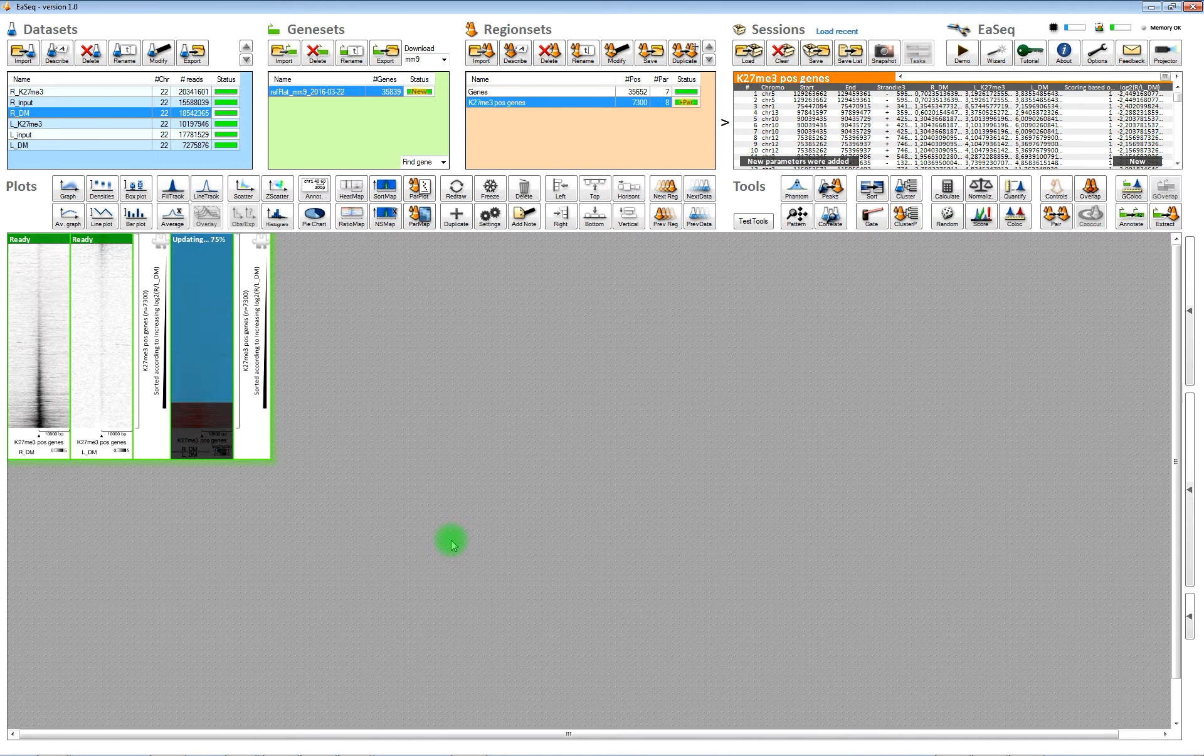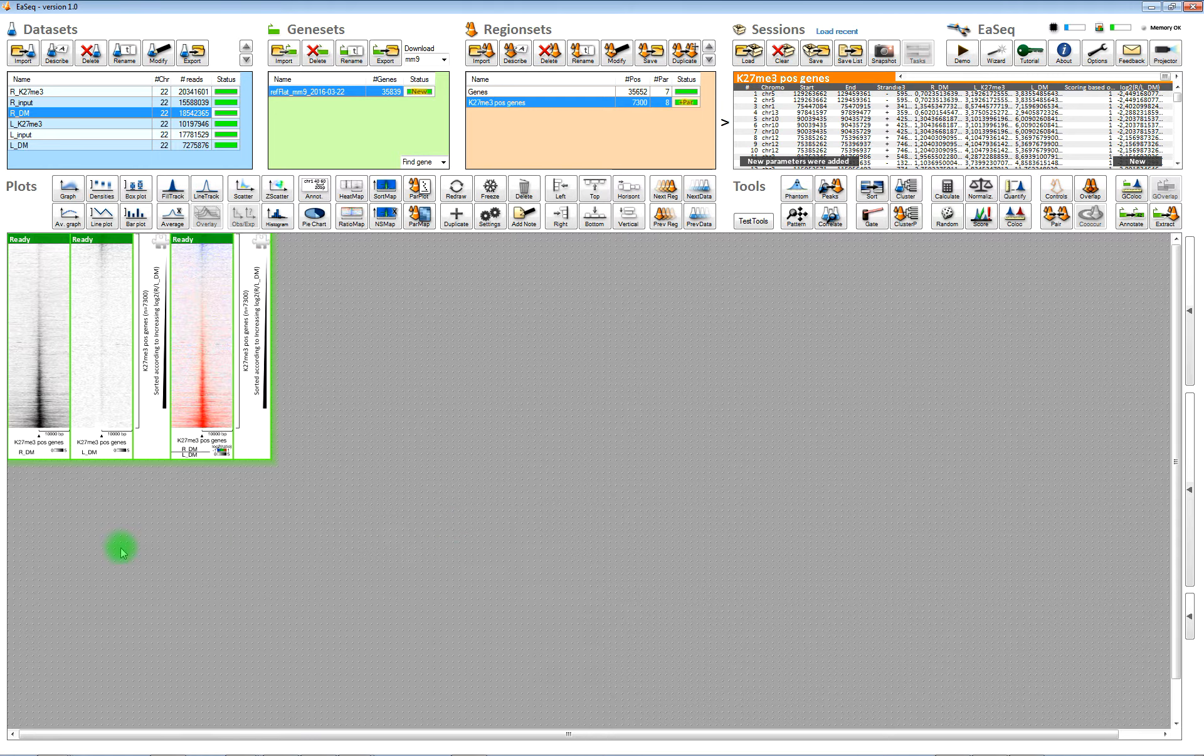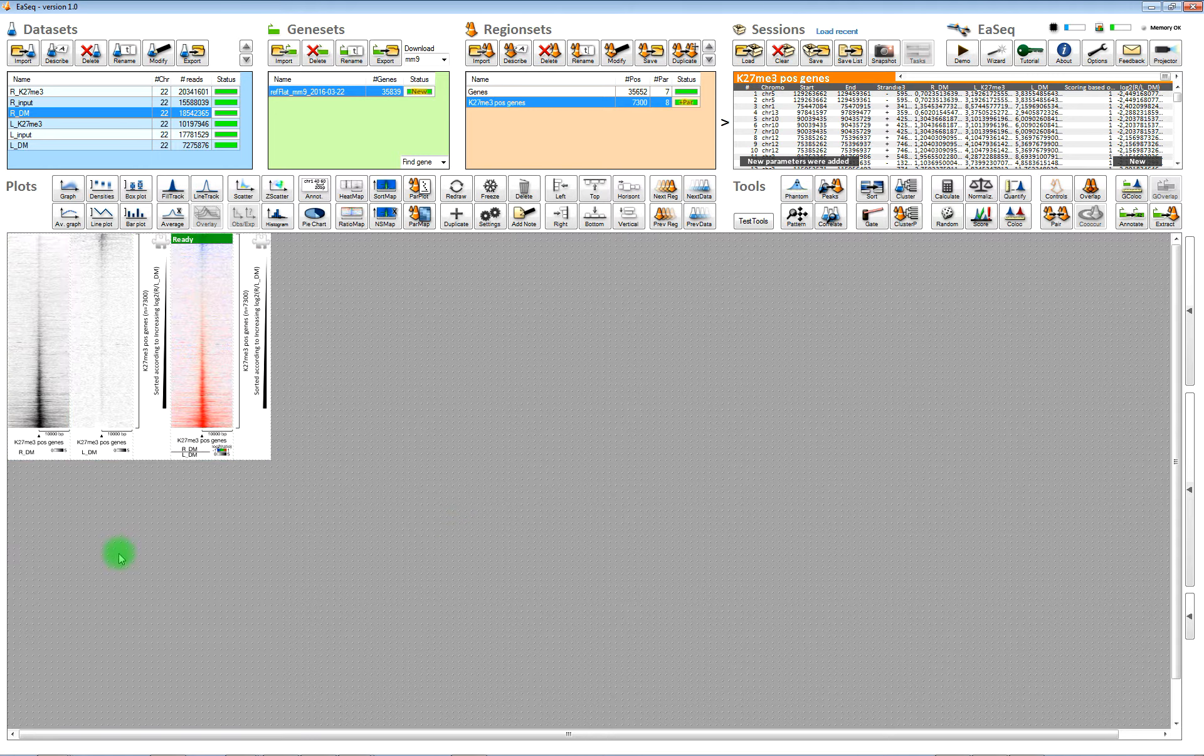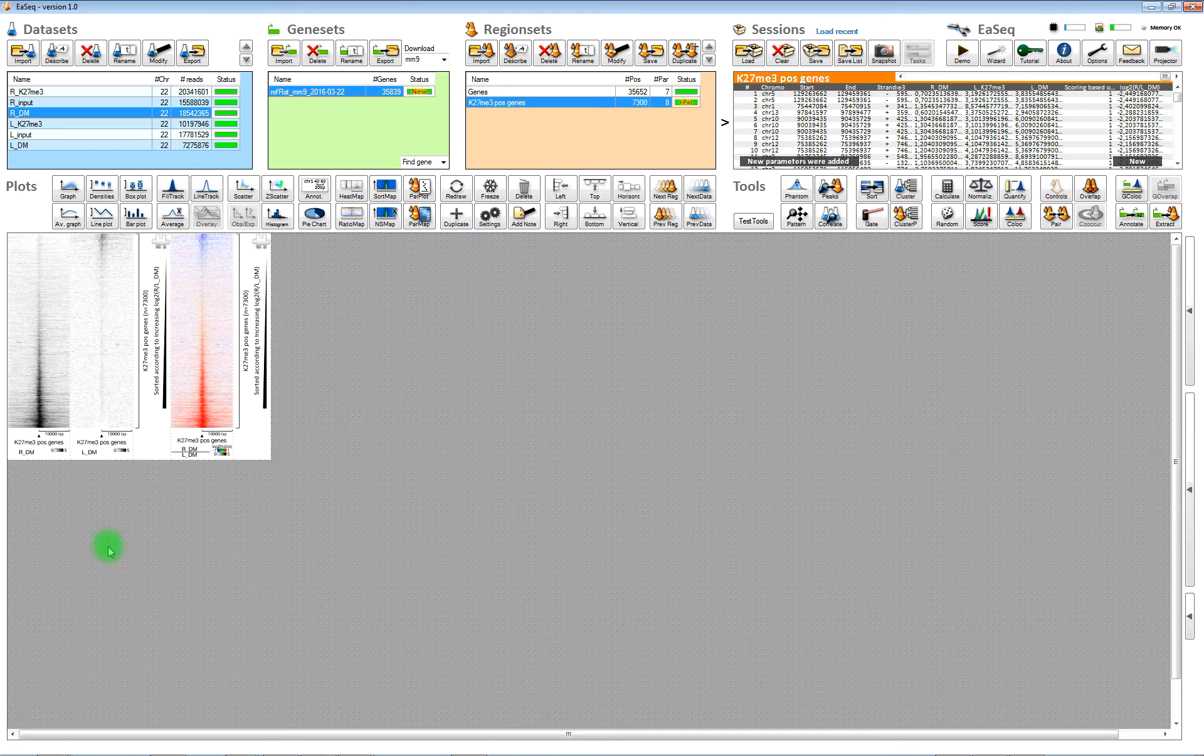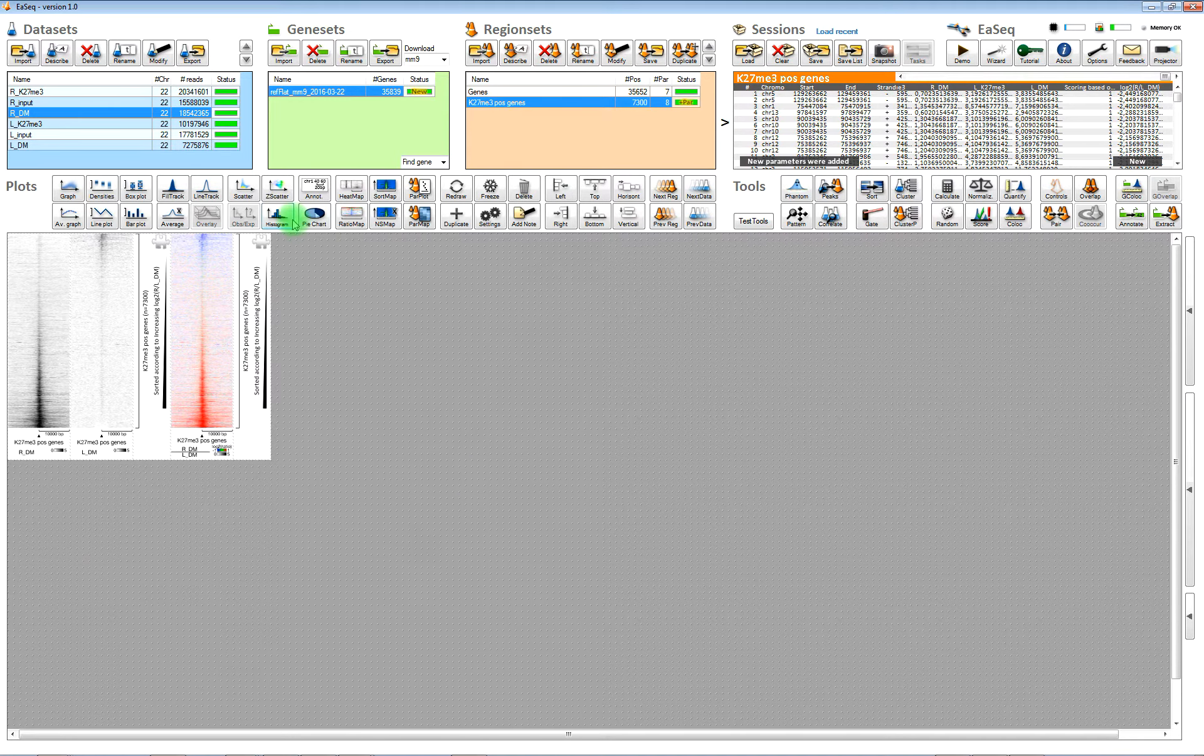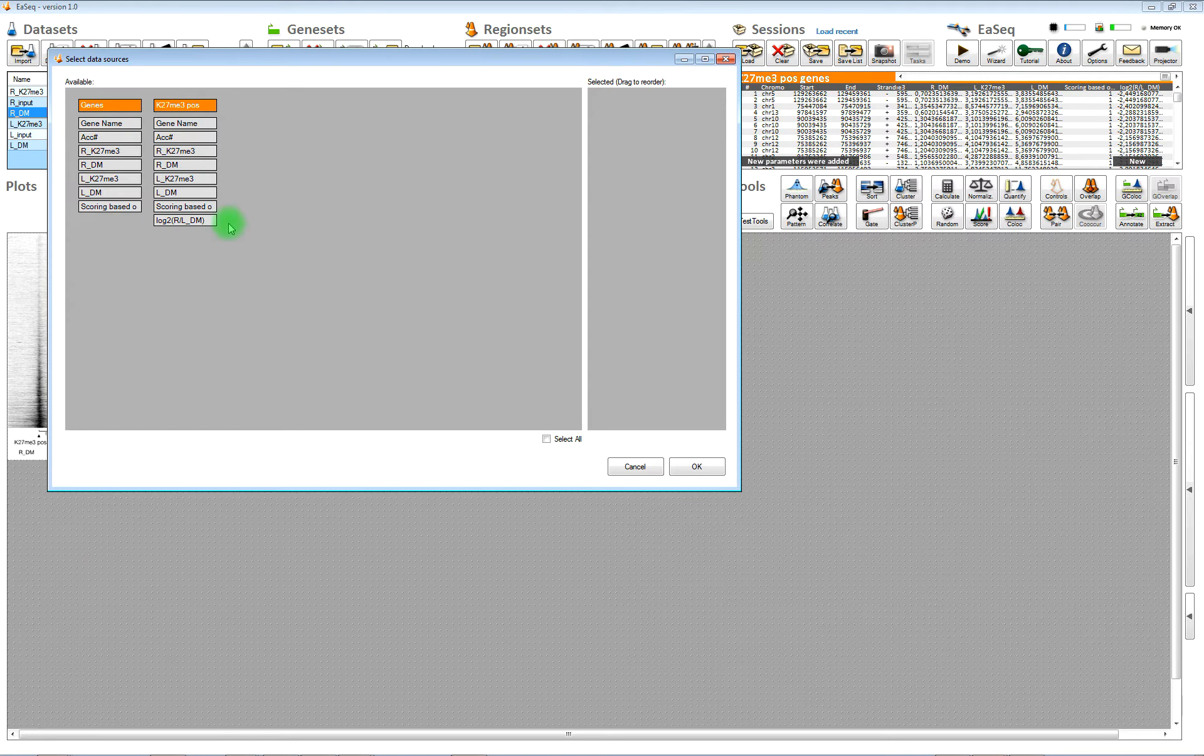Once we have changed that, then it will update and now you can see the transcription start sites of the positive genes here. So that's the transcription start sites of 7300 genes.